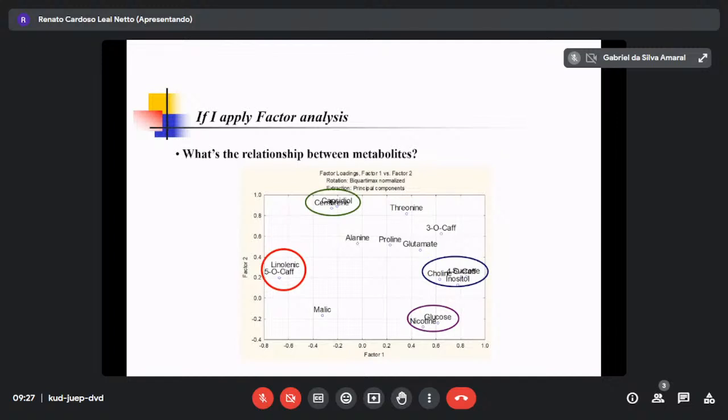Then, in the strict sense, it's not necessarily true that those two compounds are active. It's just a correlation case. Who knows? Some compound synthesized after this alkaloid may really be the active one, but LCMS or NMR can only detect that this compound is correlated.